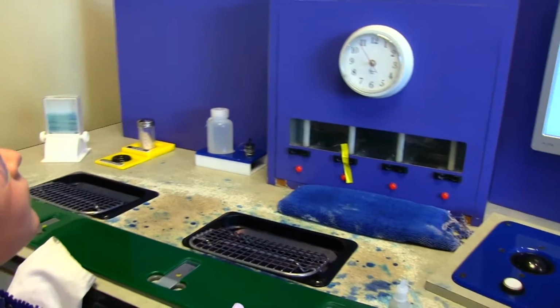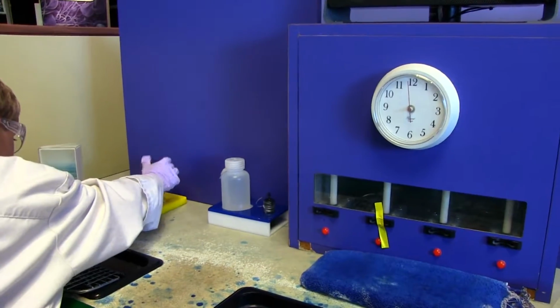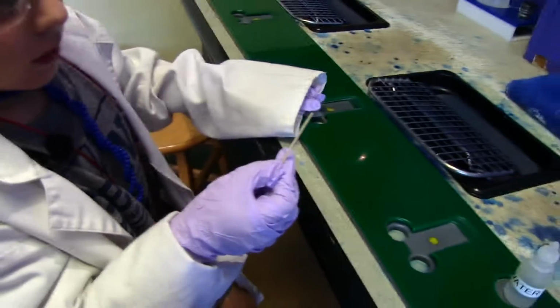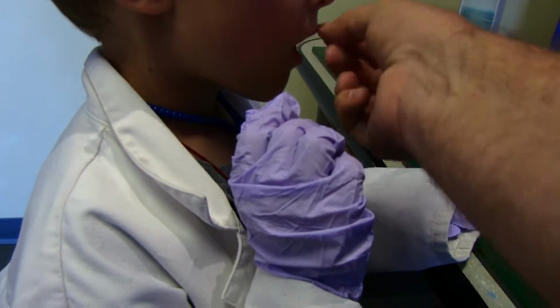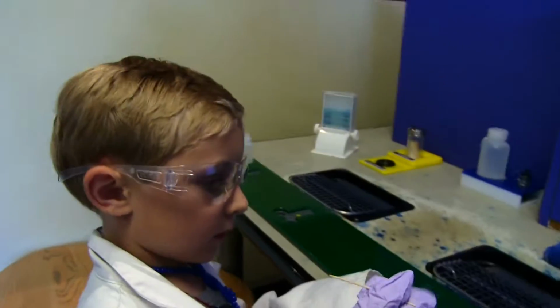Get 1 clean toothpick for yourself. Toothpick. Pick it up. Here. That one? Okay. Take the toothpick and use the round end to gently scrape the inside of your cheek. Where? The inside of your cheek. Right here. Okay, here. Now what do I do?